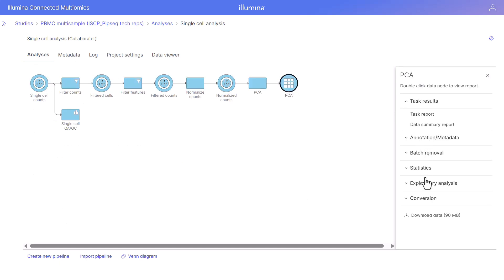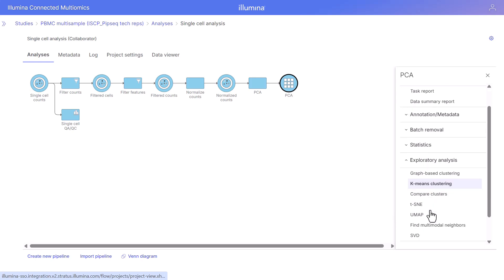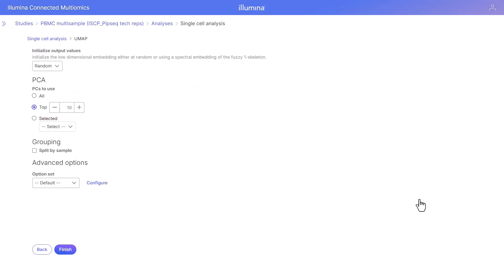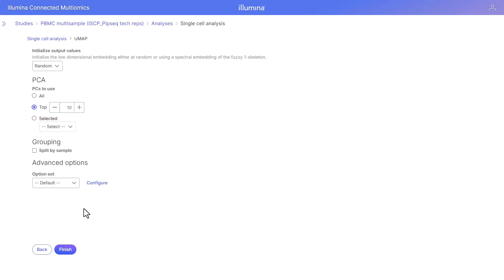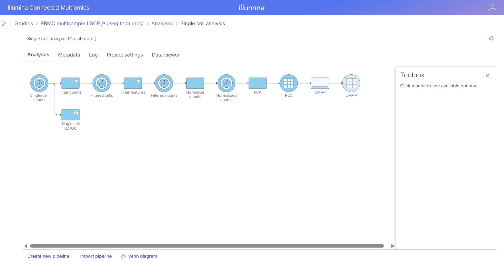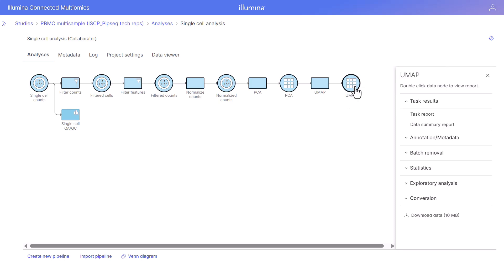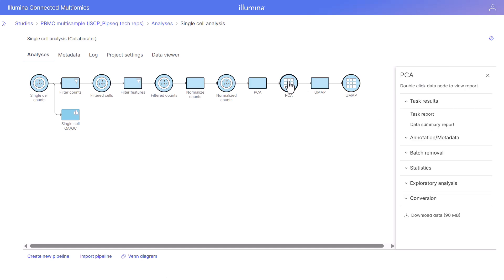Next we will continue to reduce dimensions to visualize our data with a UMAP or a TSNE. I'm going to queue the UMAP task — this is Uniform Manifold Approximation and Projection, another dimensional reduction technique. I'm going to use the default settings. You always have the option to change the advanced configuration options in any of the tasks. The UMAP task has completed. If we wanted to view these results in the data viewer we could double-click on this node or select the task report, and the same is true for the PCA node.